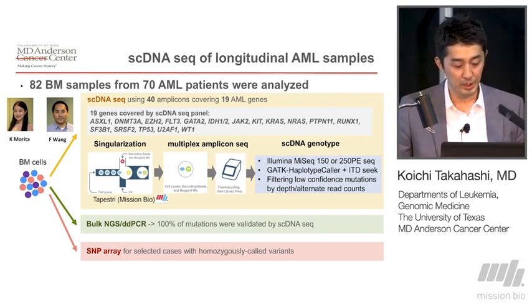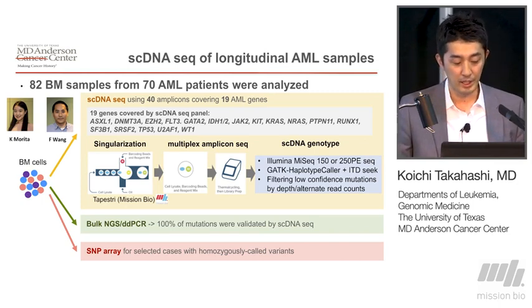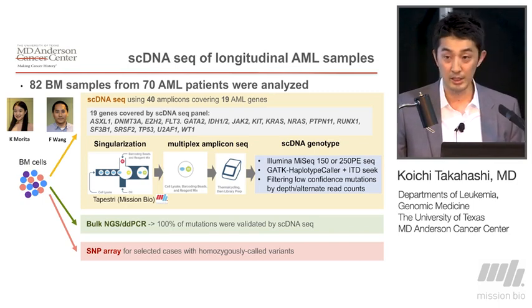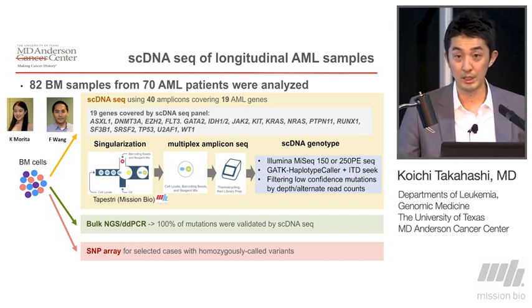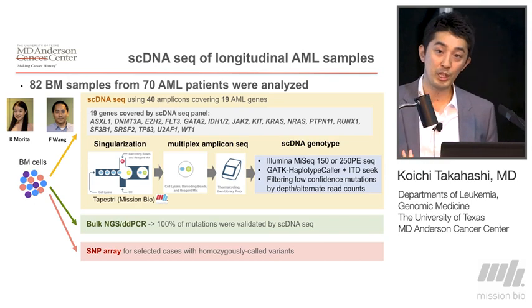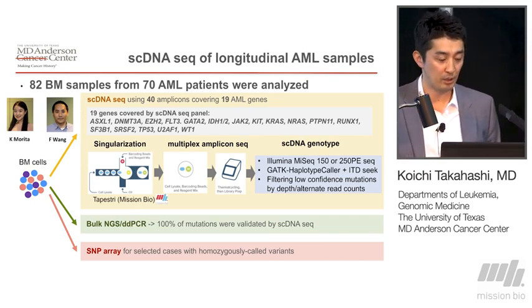We also did concurrent bulk NGS as well as ddPCR to validate the variants detected by single-cell DNA-seq. And we are very happy to see that 100% of the mutations called by the bulk-seq were also called by the single-cell DNA-seq platform.